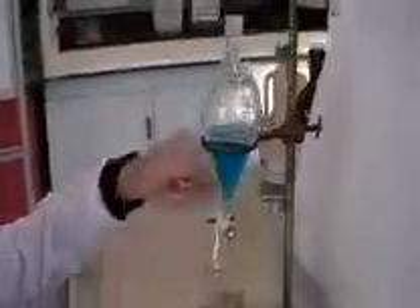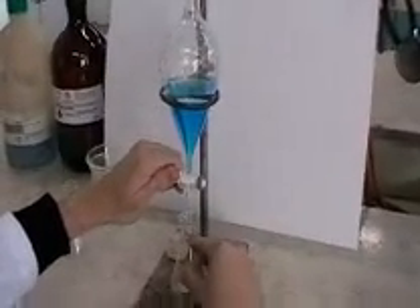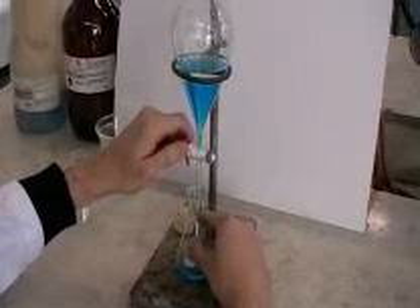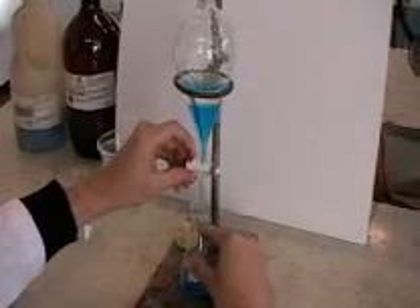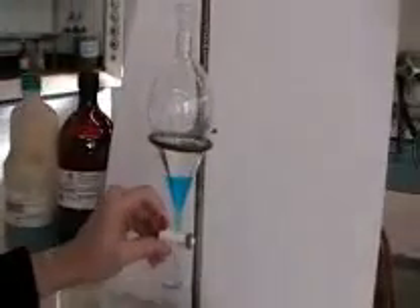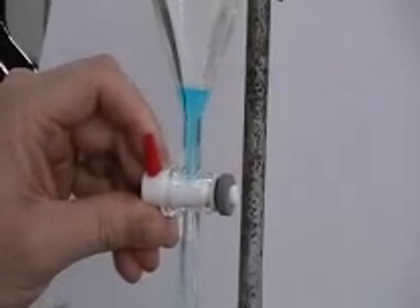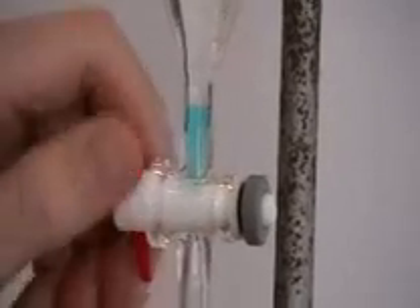Once they are all separated, you can release the one you want — by opening the tap and draining out the lower layer into the conical flask. It becomes easier to see when to stop when the level of the liquid and the interface gets towards the narrow part of the separating funnel. You can close the tap a little bit, slow it down, and get to a point where you've let just enough through.